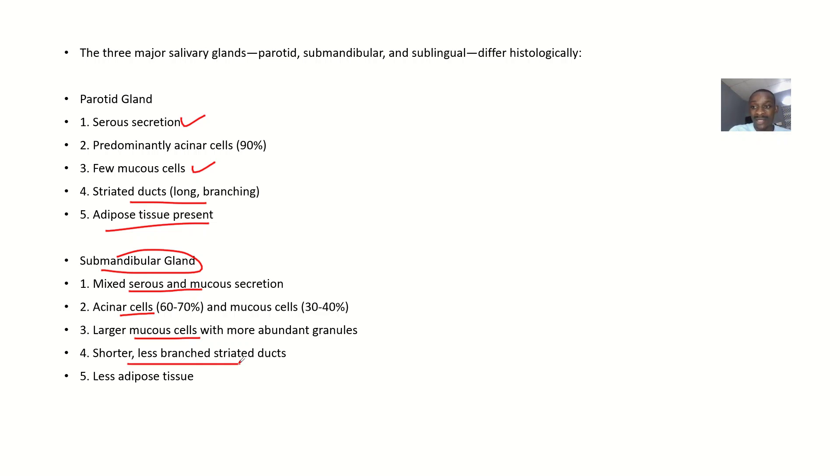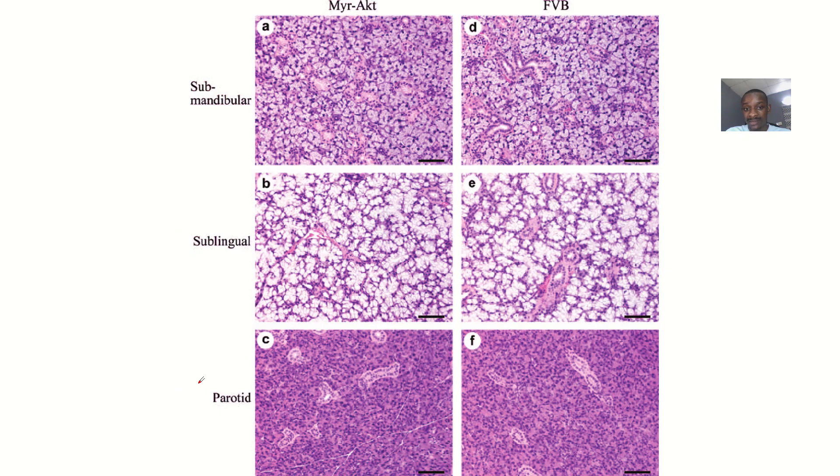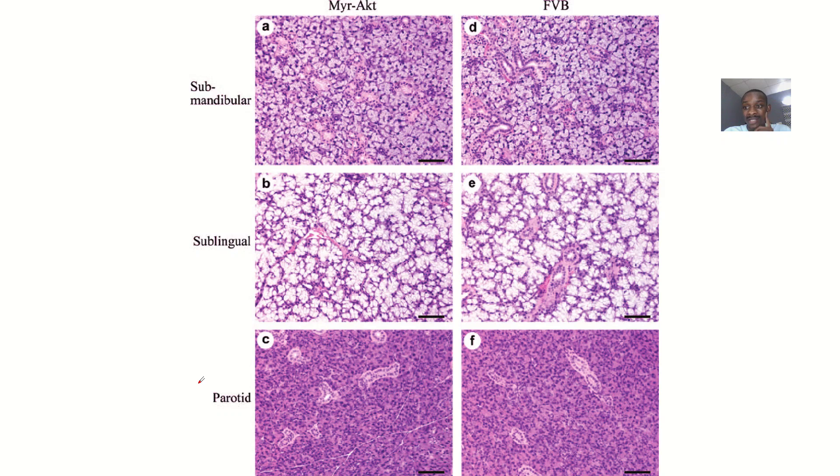It is short, it is less branch. It is short and has less branch striated duct. It has less adipose tissues present in it. So this is just a histological slide, which you could take time to actually look at it.